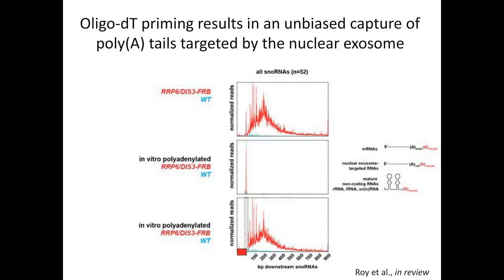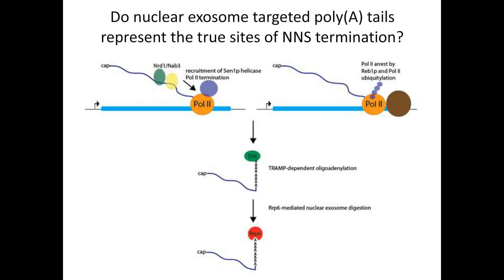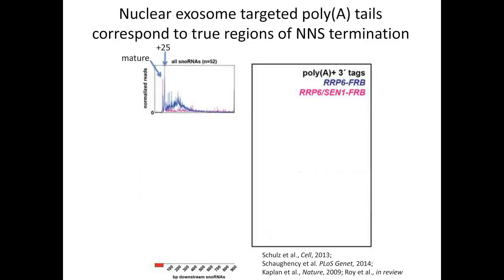And so from these data, we could conclude that the QuantSeq library preparation protocol is efficiently priming these nuclear exosome targeted poly-A tails. And so the next question we had to get into more of the biology was, are these poly-A tail transcripts that we identify upon nuclear exosome inactivation really representative of the true sites of termination of RNA polymerase by the NNS pathway? And so what we decided to do was look at previous data in combination with data that we were obtaining.